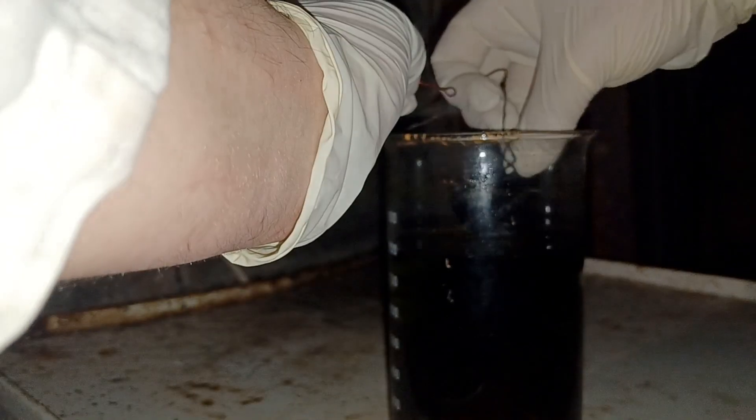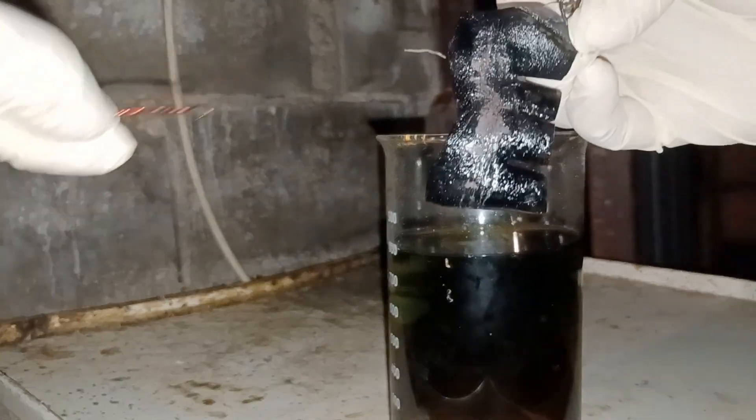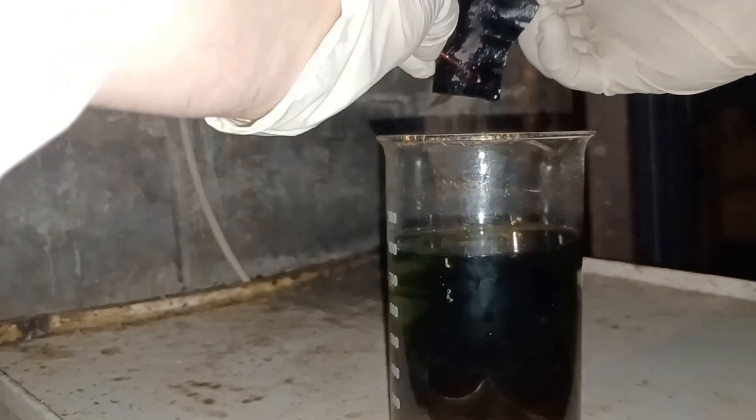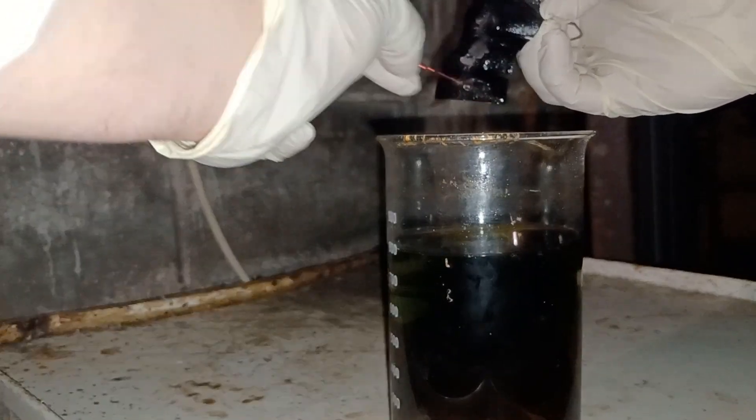Don't you worry, I will get all of it, but it might take me a minute or two. This is because reduced palladium metal sticks to the copper surface and protects it from reacting with more palladium ions. To get around this I had to physically clean the surface.